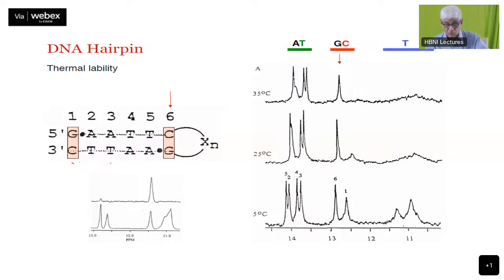What is present in the loops, we do not know. These are T loops. Some of those are seen in these loop areas. So these are the base paired ones. As we increase the temperature, they will start disappearing. Now this will also help you in the assignment. You monitor the changes in the intensities. This will tell you which of these base pairs are opening up first.